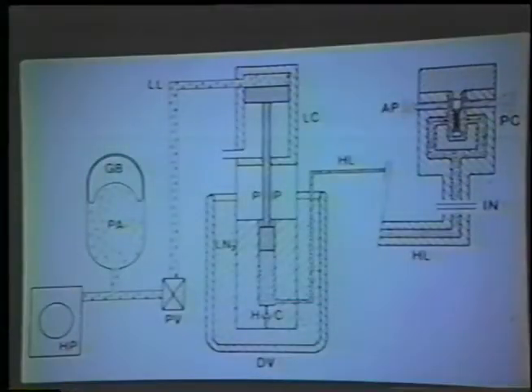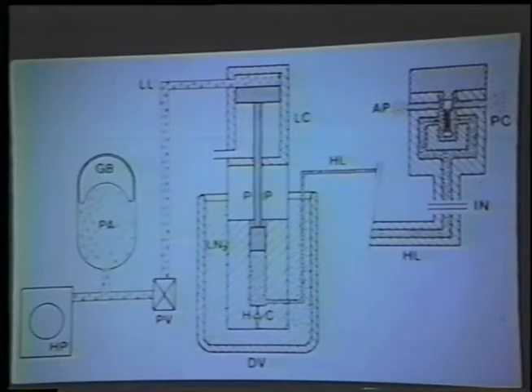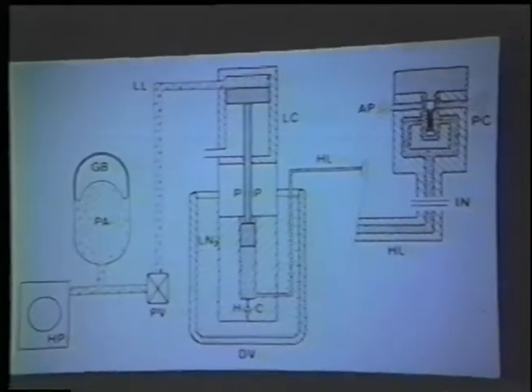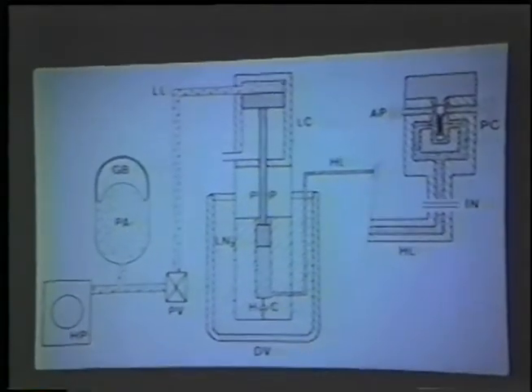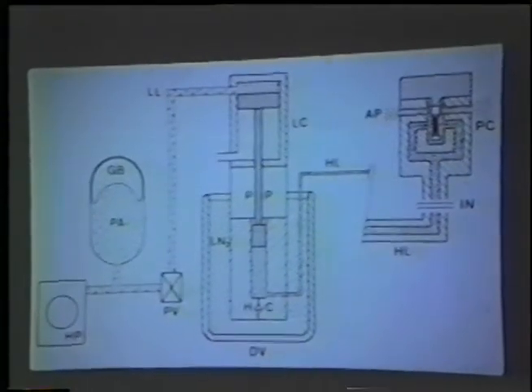Remember that? Okay. Now, high pressure freezing. As we discussed earlier, this is a technique for freezing very thick samples. It isn't as rapid as the other techniques in the interior of the sample, although it may be just as rapid in the peripheral regions of the sample. But what it's really going to be useful for is getting at the interior of tissue samples, or large cells, systems that we really haven't been able to look at before with other ultrarapid freezing techniques.